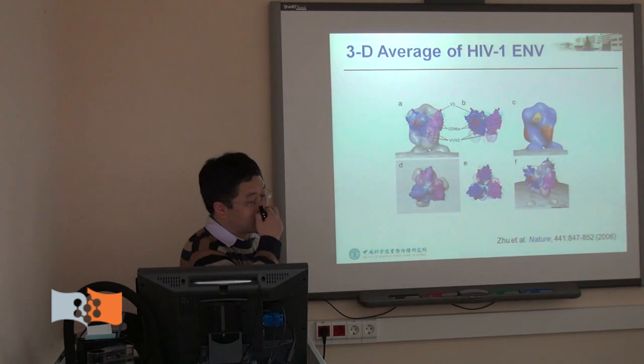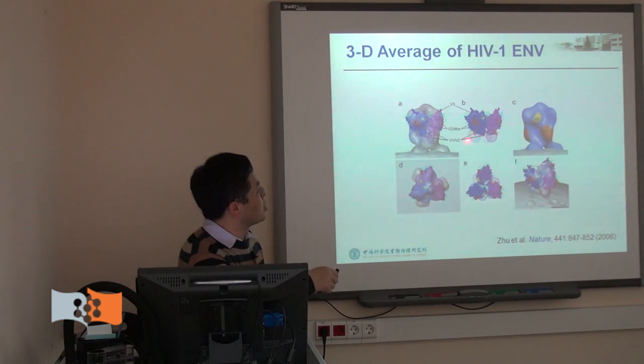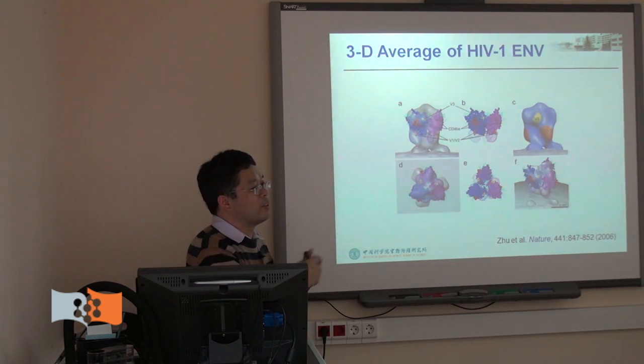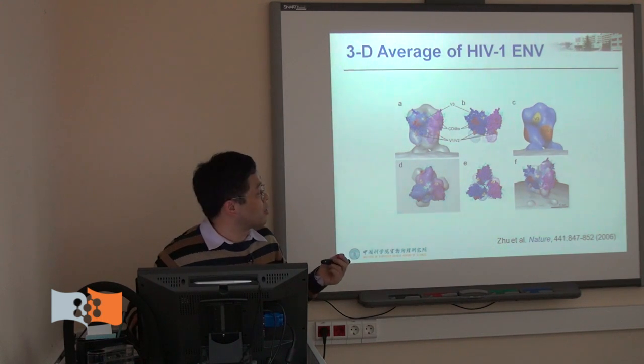After that I came back to IBP. We didn't follow this much, but actually there are some other people trying to do this, trying to combine them. For example, after you put the CD4 in, you can see where CD4 binds, so this can clarify where the CD4 binding site is. And there are also some antibodies. We know the epitope, so we can see the antibody here, and we can try to identify different locations of the neutralizing antibody binding sites.